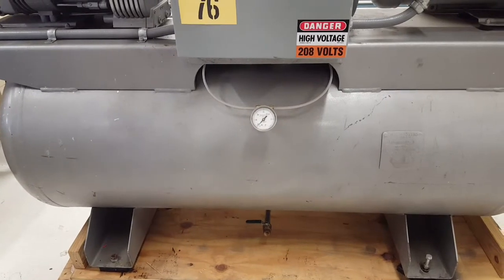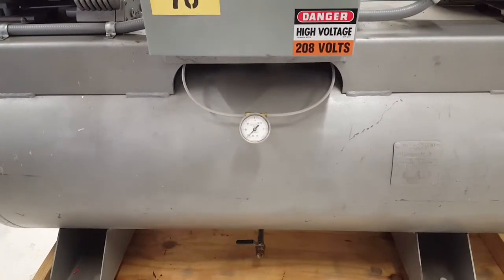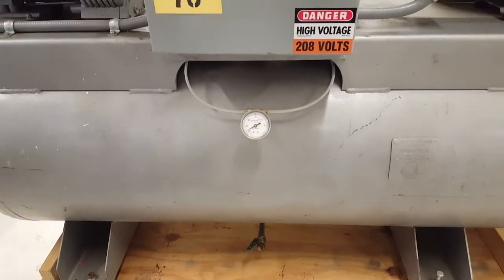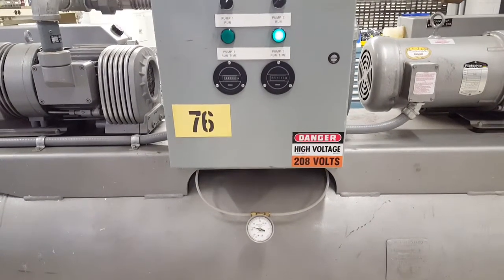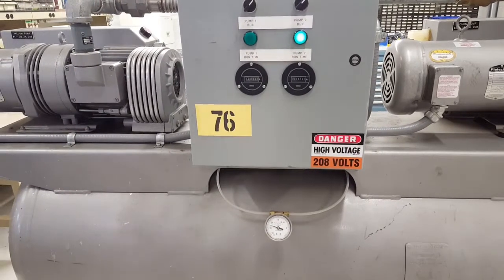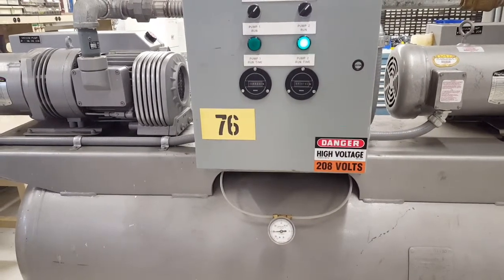The pump turned off because the run timer stopped, but we'll simulate that there's a draw and pump number two turned back on to bring the pressure back down.